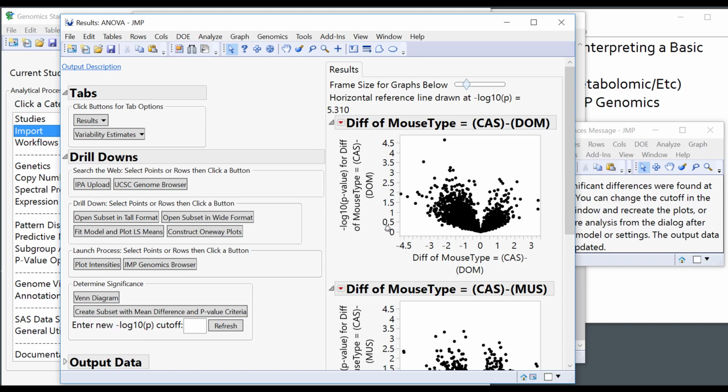How would you know the difference between something that had 5 zeros and something that had 15 zeros? So that minus log 10 is actually essentially answering that question. It's saying we're looking at a p-value that's got essentially 5 places after the decimal point. So 0.00001 is approximately this equivalent p-value.